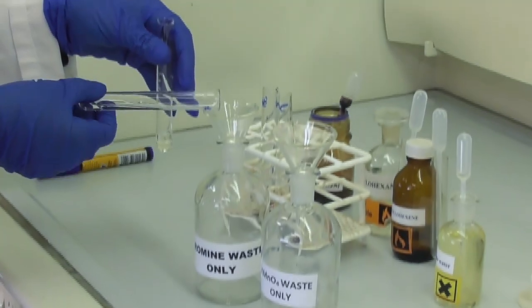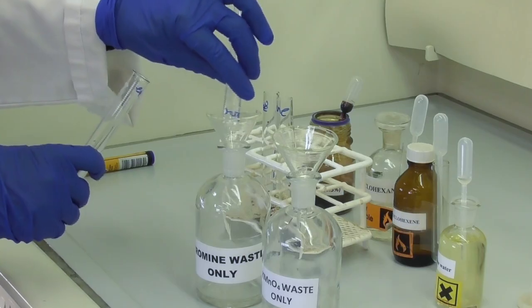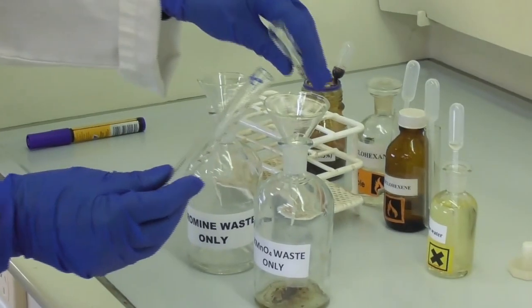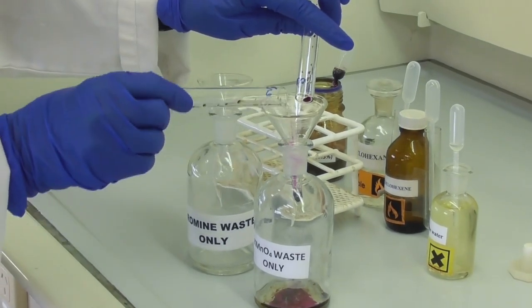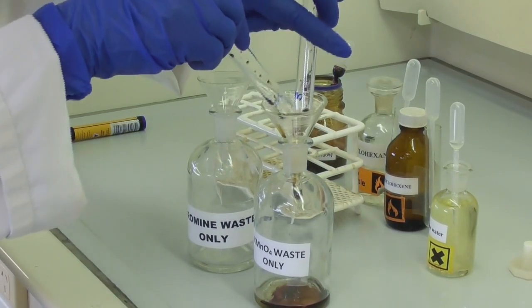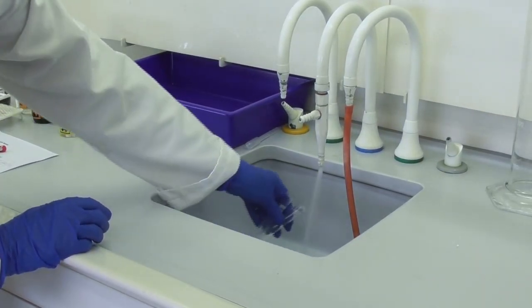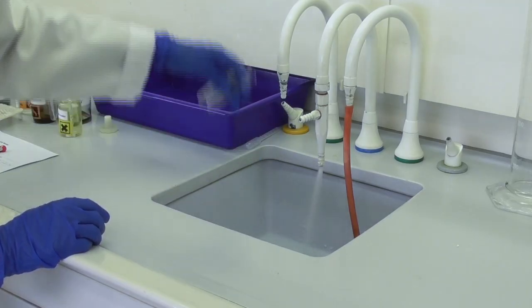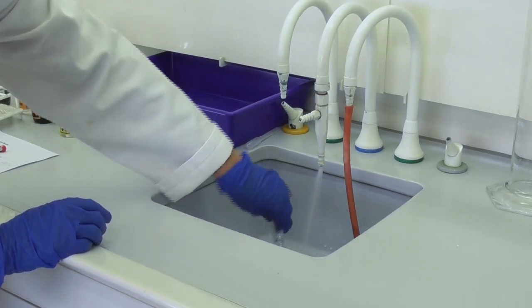In this experiment we dispose of the waste in separate containers: one bottle for bromine waste and a second bottle for permanganate waste, both clearly labeled. We then wash the empty test tubes in the sink inside the fume hood and leave them in the tray inside the fume hood to make sure that the fumes stay contained.